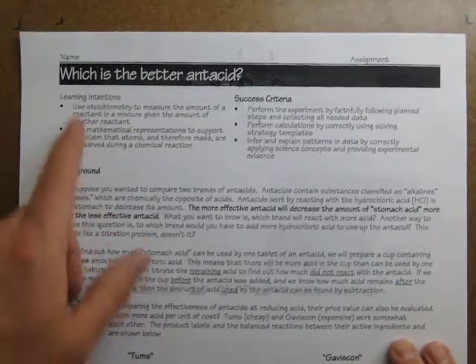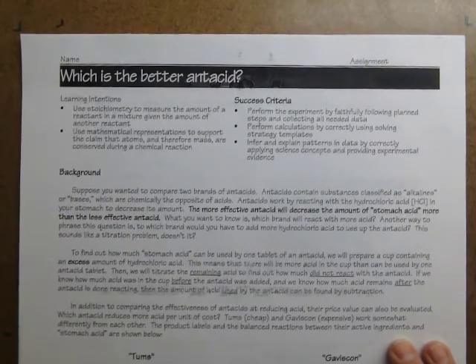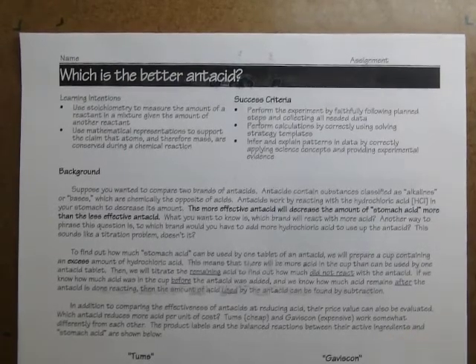Please make sure you have your copy of Which is the Better Antacid. What we'll do is look at how to do the calculations for all the parts of the experiment. Before doing this, you should have watched the video showing how the procedures were followed, and then the video that shows how the data were collected. Now what we'll look at is all the different calculations that go along with the lab.